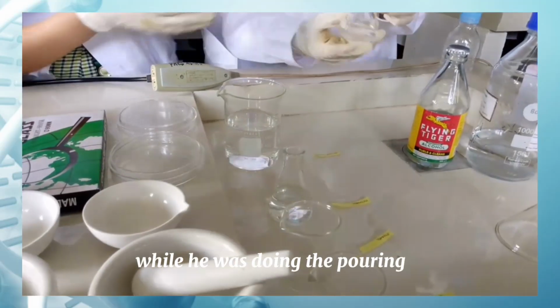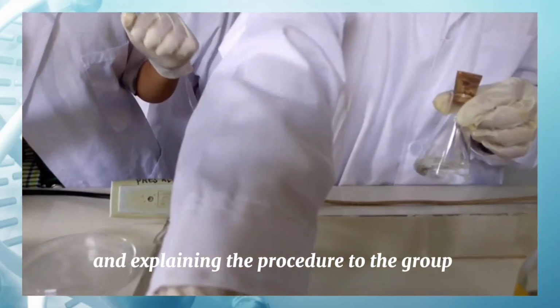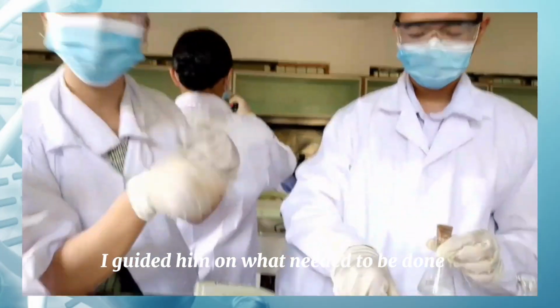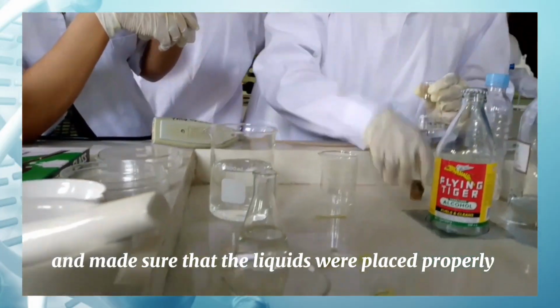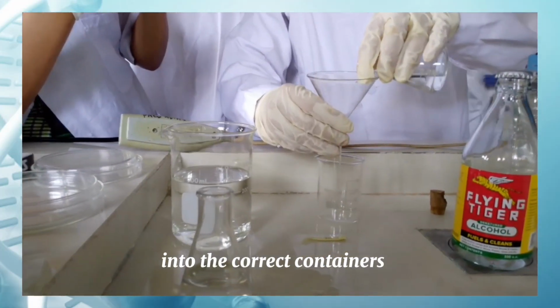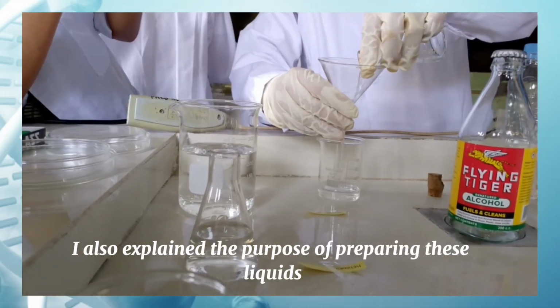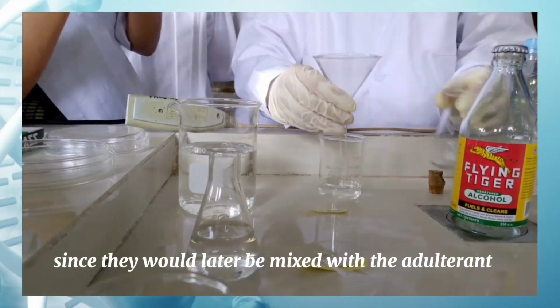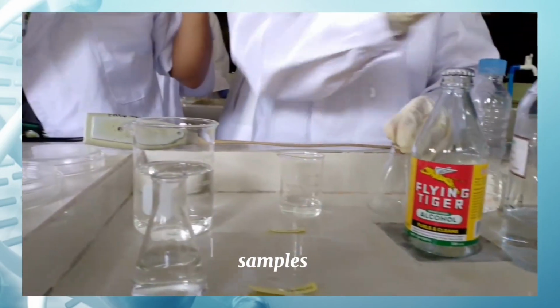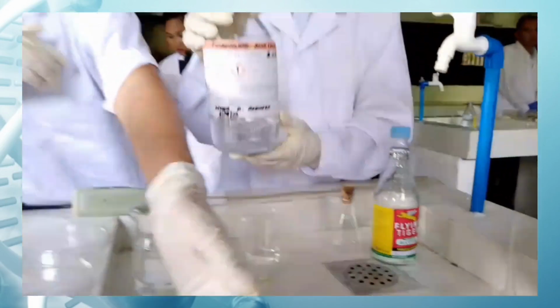While he was doing the pouring, I was the one giving instructions and explaining the procedure to the group. I guided him on what needed to be done and made sure that the liquids were placed properly into the correct containers. I also explained the purpose of preparing these liquids, since they would later be mixed with the adulterant samples to observe their physical changes and reactions.